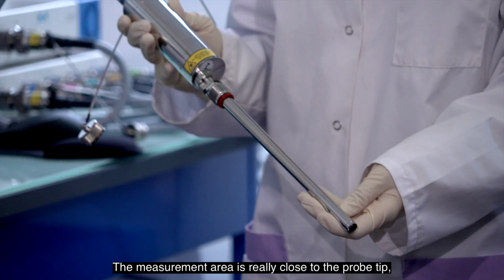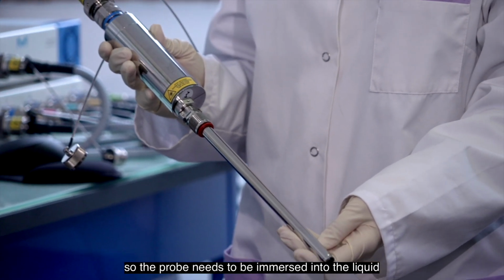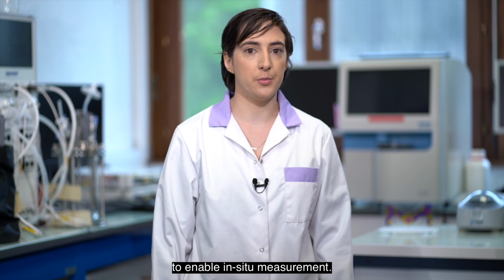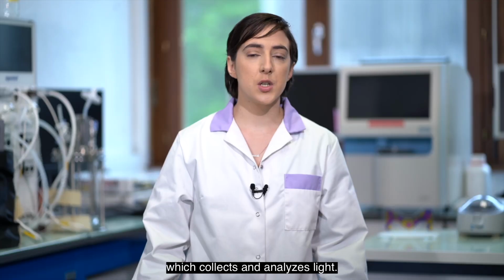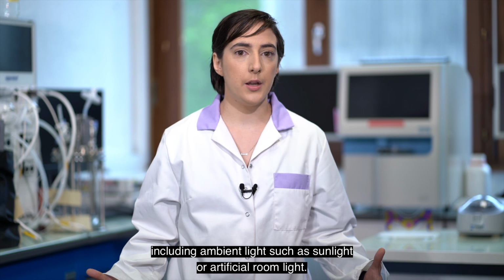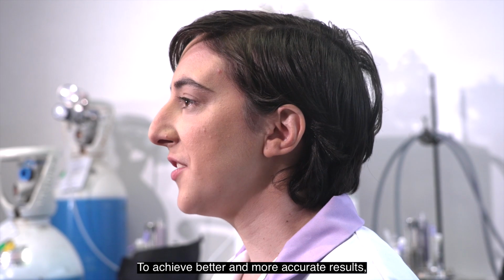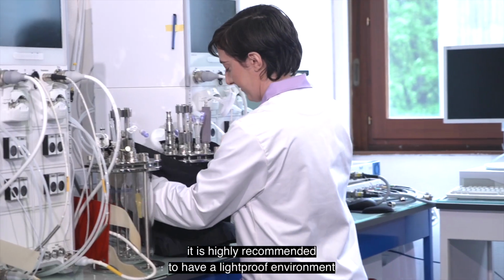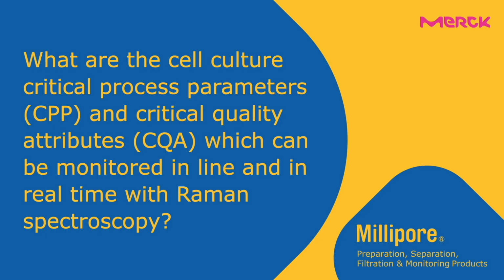The measurement area is really close to the probe tip. The probe needs to be immersed into the liquid to enable in situ measurement. Also, Raman spectroscopy is an optical technique which collects light. It means that it is sensitive to all kinds of light, including the ambient light, such as sunlight or artificial room light. To achieve better and more accurate results, it is highly recommended to have a light-proof environment around the area of the measurement.